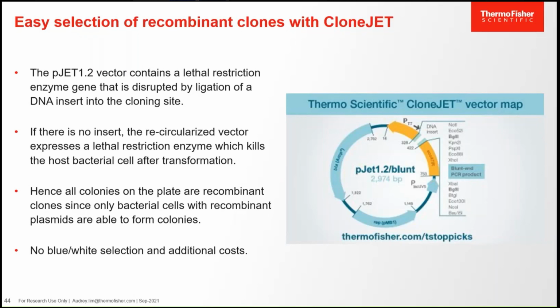Therefore, all the colonies that survive on the plate shall contain the recombinant plasmid, meaning they carry the insert. So there is no need for blue-white selection that needs extra cost, where you need to buy X-gal, IPTG, or that extra reagent.